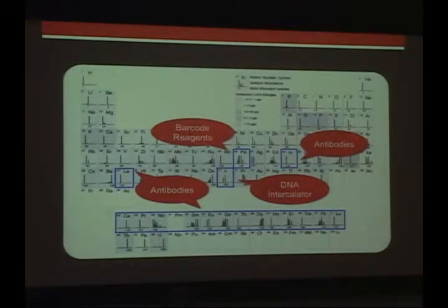But essentially, it's a way for us to mix divergent samples, stain them all in one tube to remove technical variability, run them on the machine at the same time, and then deconvolute the data back out into the samples that you mix together.